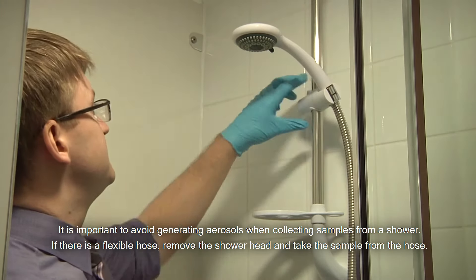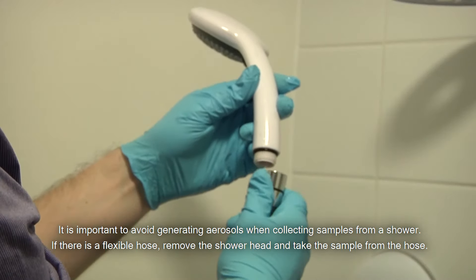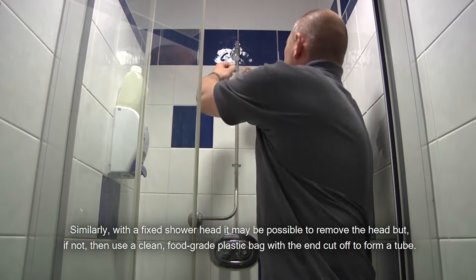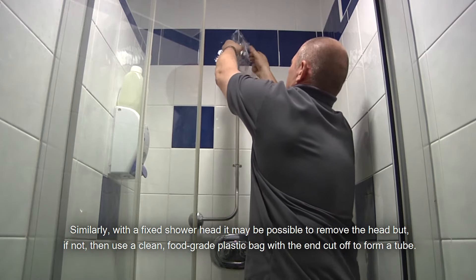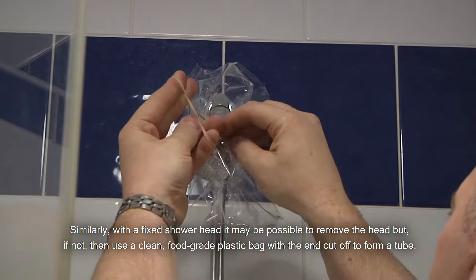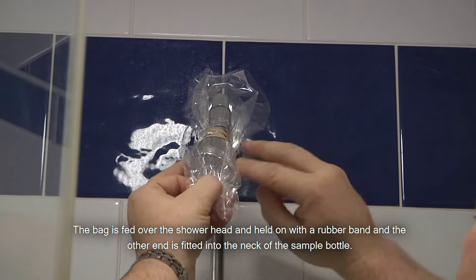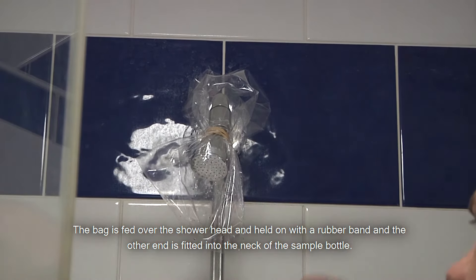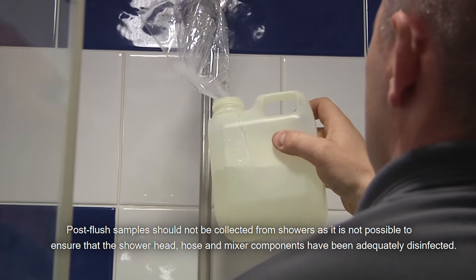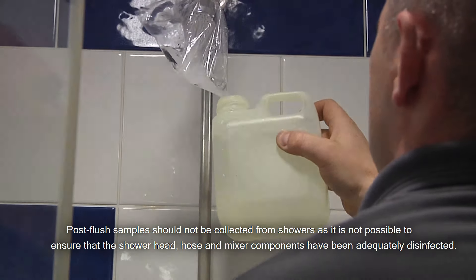It's important to avoid generating aerosols when collecting samples from a shower. If there is a flexible hose, remove the shower head and take the sample from the hose. Similarly, with a fixed shower head, it may be possible to remove the head, but if not, then use a clean food grade plastic bag with the end cut off to form a tube. The bag is fed over the shower head and held on with a rubber band, and the other end is fitted to the neck of the sample bottle. Post-flush samples should not be collected from showers as it's not possible to ensure that the shower head, hose and mixer components have been adequately disinfected.